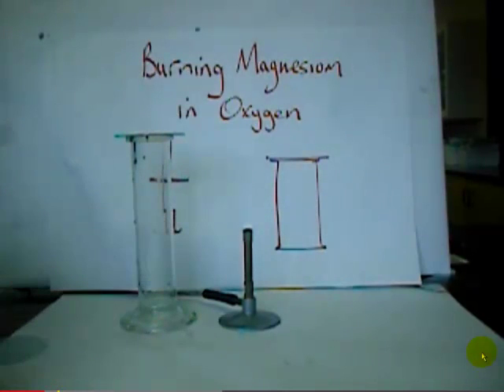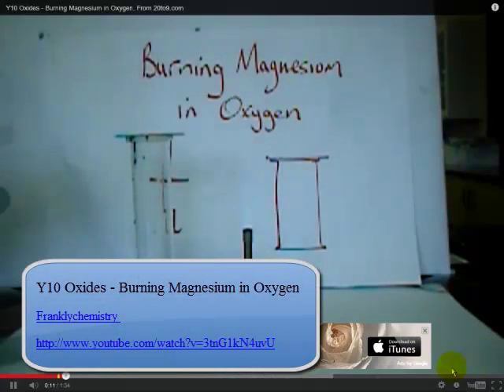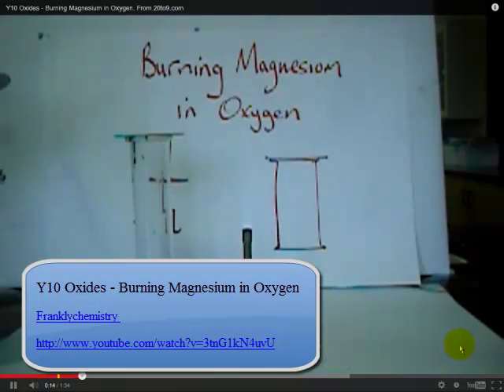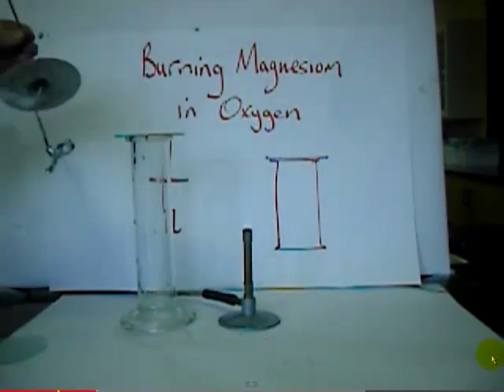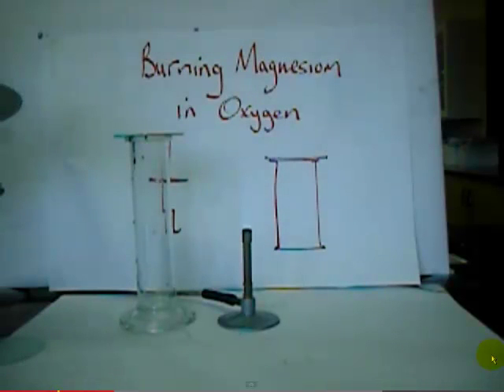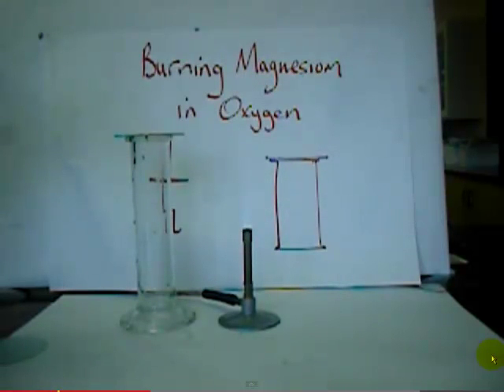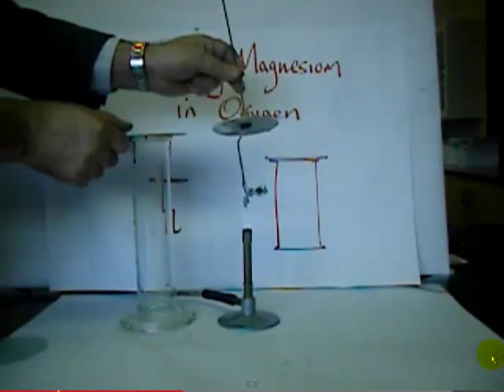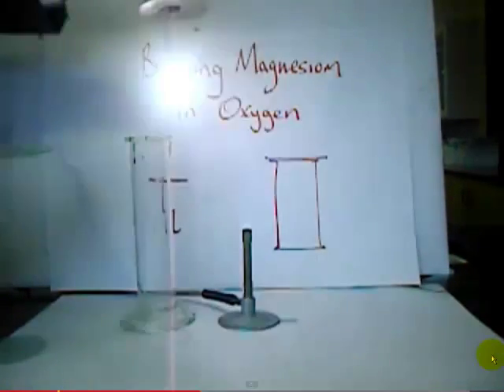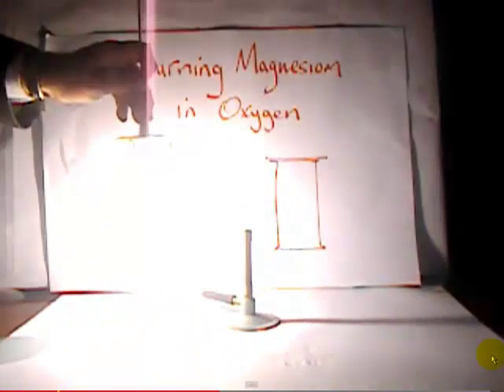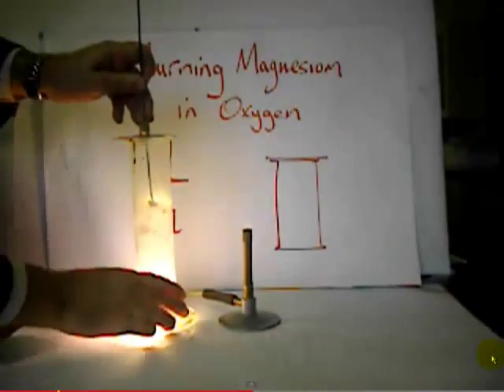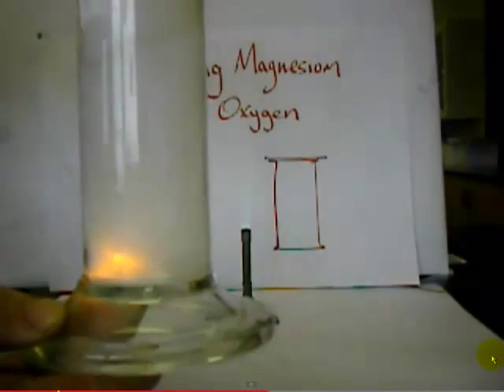Let's take a look at the reaction of magnesium with pure oxygen. I'll ignite the magnesium in air first — air is one-fifth oxygen. When I lower it into a jar of pure oxygen, the reaction becomes more vigorous. If showing this live, I would warn you to look at the flame indirectly, as it is very bright and can cause permanent damage to the retina. We ignite it in air, then lower it into the jar — it burns even brighter in pure oxygen, producing a white smoke, which is magnesium oxide.